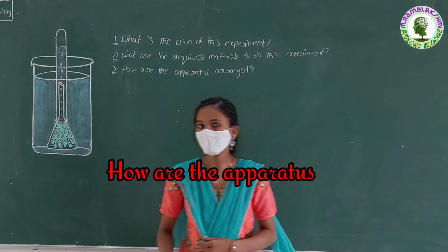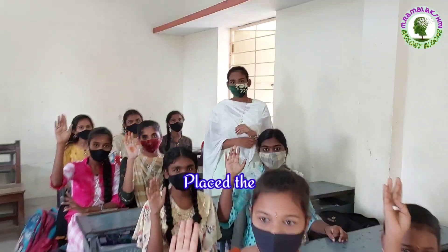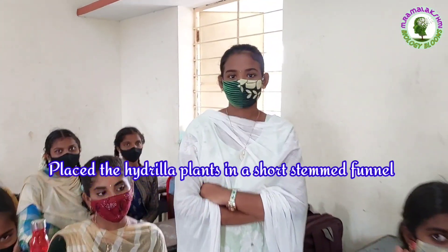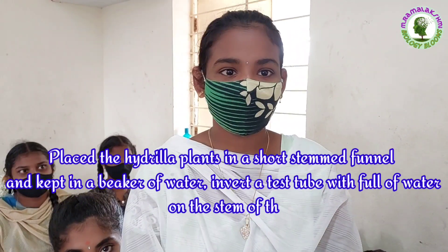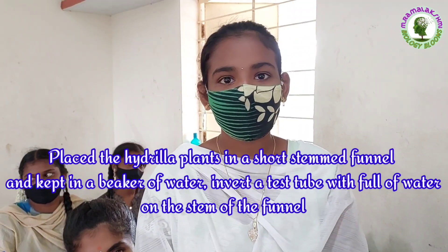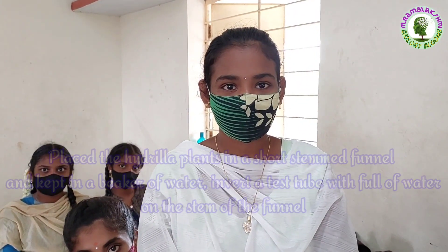How are the apparatus arranged? Umanageshwari: Place the hydrilla plants in a short-stemmed funnel and keep it in a beaker of water. Then invert a test tube full of water on the stem of the funnel.